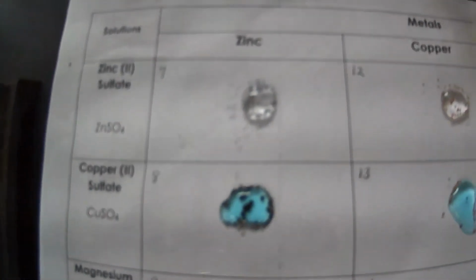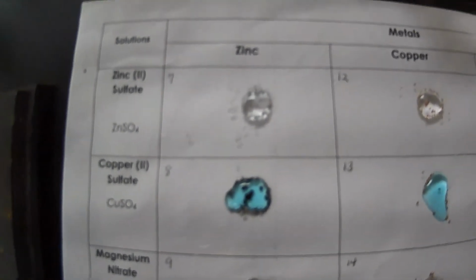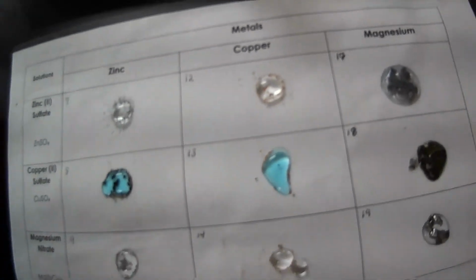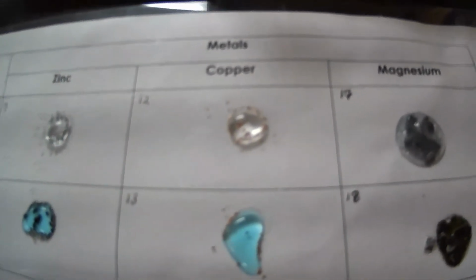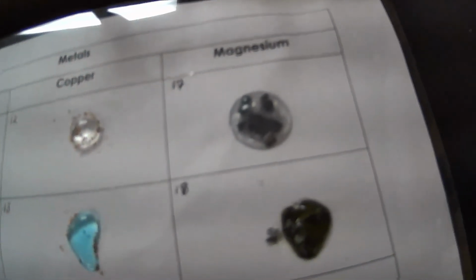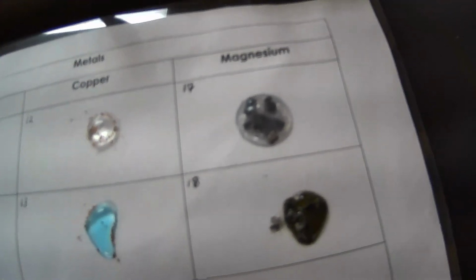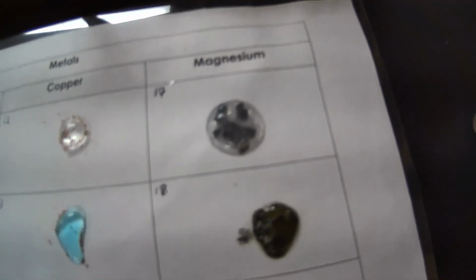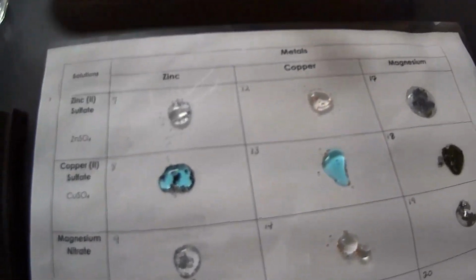All right, so let's just pan so that we can see some observations here. So this is our zinc with the zinc sulfate. Looks like there's no change, okay, no reaction. With our copper, not seeing any changes there either. And then you can see with our magnesium, hopefully it shows through, but we have a darker gray. There's bubbles being produced as well. So that was the zinc sulfate.